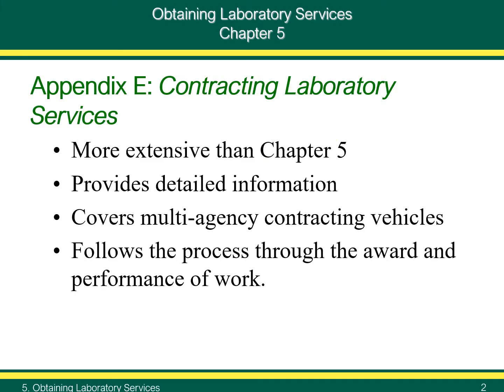Slide 2. Obtaining Laboratory Services. This module of the online MARLAP training course will address obtaining laboratory services. MARLAP Chapter 5 addresses considerations for obtaining laboratory services. This module will also present material from Appendix E of MARLAP, Contracting Laboratory Services.